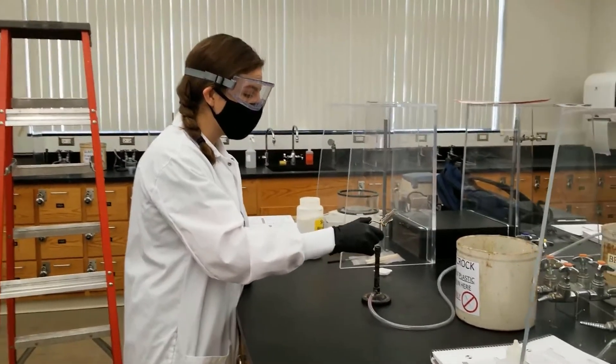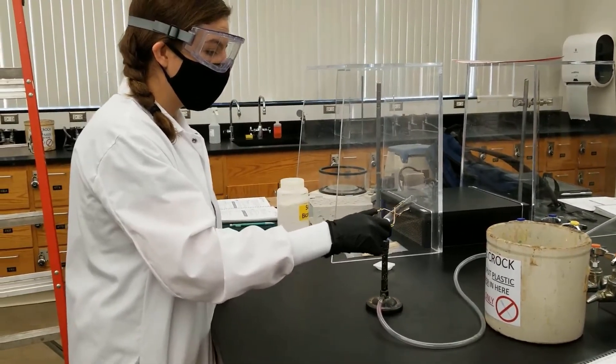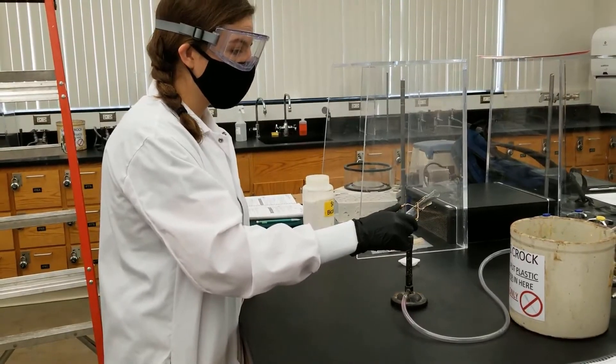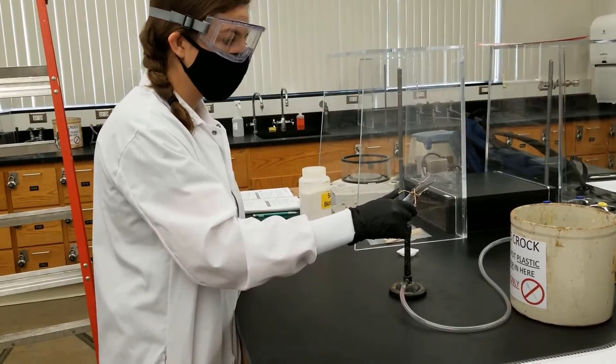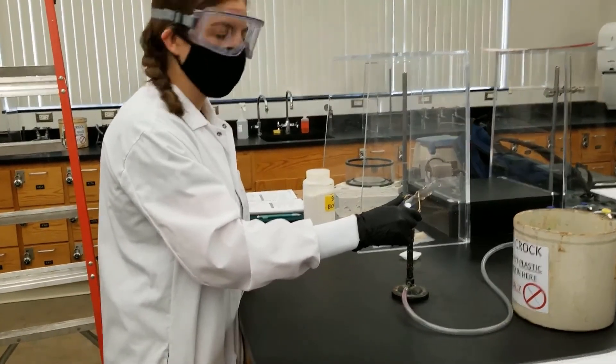We are going to heat baking soda over a flame, and we are going to hope to see condensation, which you can see if you come closer.